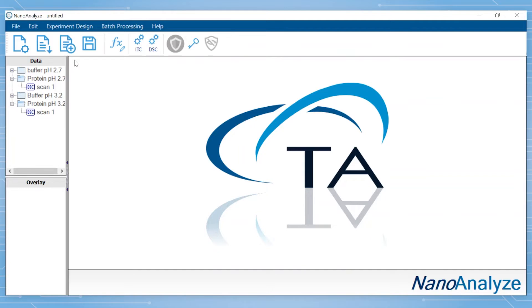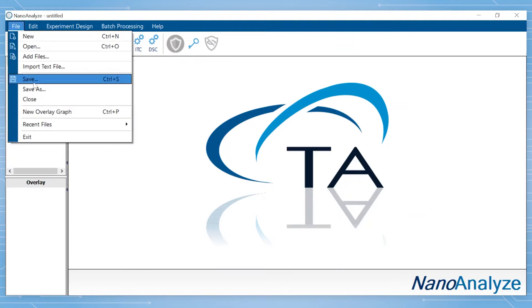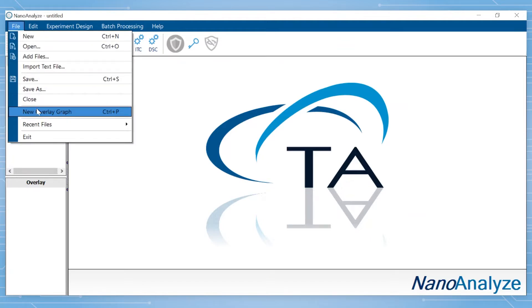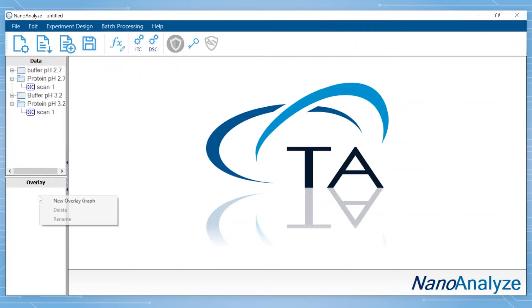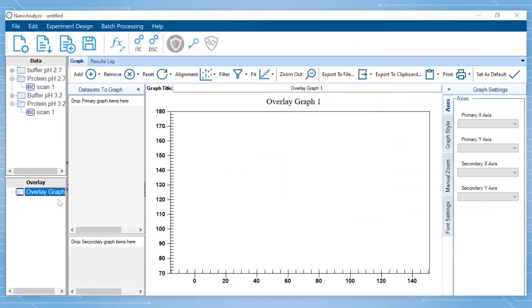To create the overlay graph, either go to File, Create New Overlay Graph, or in the Overlay Graph box, right-click and select New Overlay Graph.